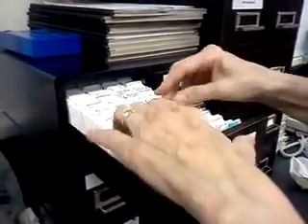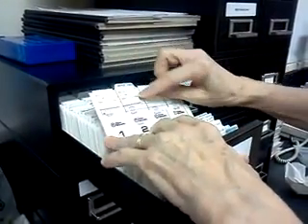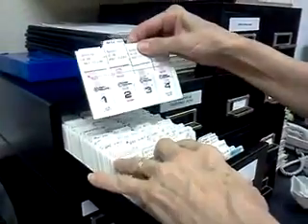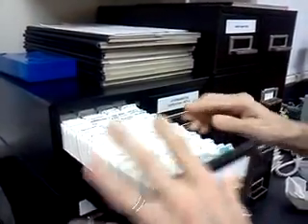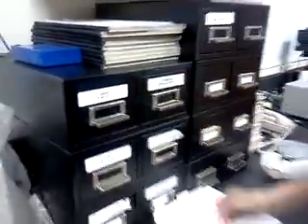Now, the drawers are great because now you can put the slide identity there, and then we have our antibodies, all the different antibodies we've used, so we can go back in time and say, oh, I did an H&E stain. How'd that H&E stain look back there on 12204? And there it is. You can pull it and look at it. So that's how we keep track of that.